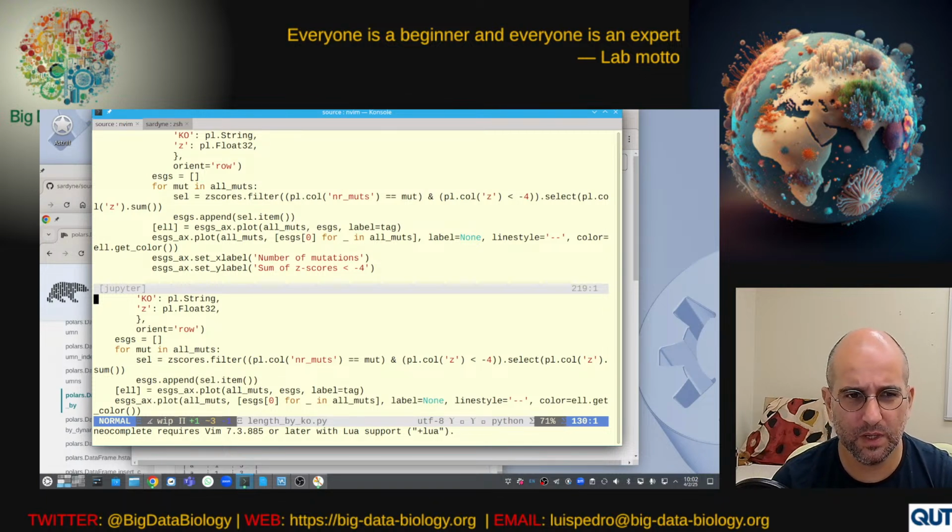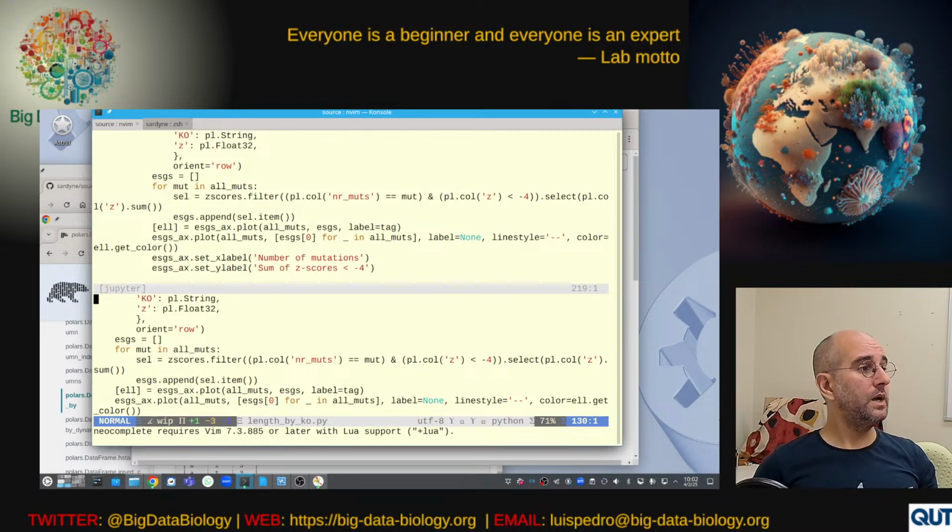We have now a concrete value that can be computed based only on the outputs of CheckM2, and it will print out a number.